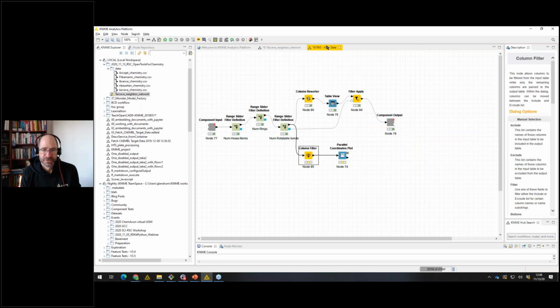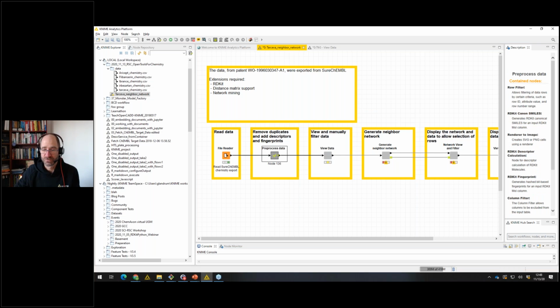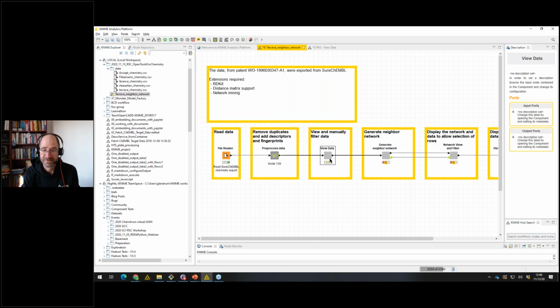It is confusing though, particularly when you're first getting started. Basically, there's almost no reason to not always use components. Using metanodes is simpler, but it's almost an advanced user thing, because I'm saying something to somebody who knows KNIME workflows by putting things in a metanode. I'm just saying this is just organizational, whereas this may actually have views and configuration attached to it.